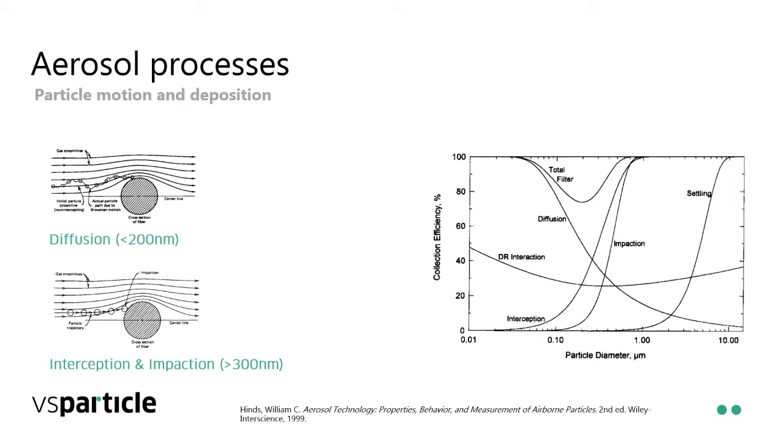So if you take a typical HEPA filter, for example, or let's say a face mask, the fabric that's in there, any aerosol that goes through it, very small particles will travel through these small holes in the fabric, but they will still get captured because they will move around. And the bigger particles, they don't follow streamlines either. They can go straight and impact directly on the fiber. And all that combines into this graph here to the right.